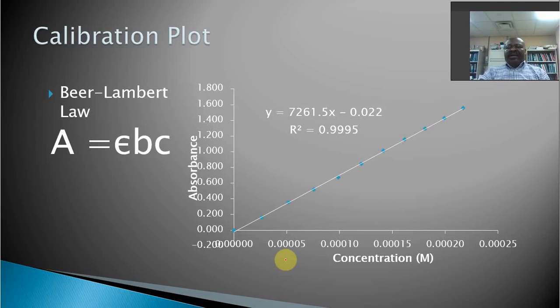Add another 0.1 milliliter increment. Stir it a little, let it settle down, measure the absorbance. Continue doing that until you've added 10 or so, or until the absorbance is 1.5. Stop around then. You'll have an Excel sheet. You'll be able to calculate the concentrations of the product, FeSCN, based on the number of moles of the thiocyanate that you actually added.